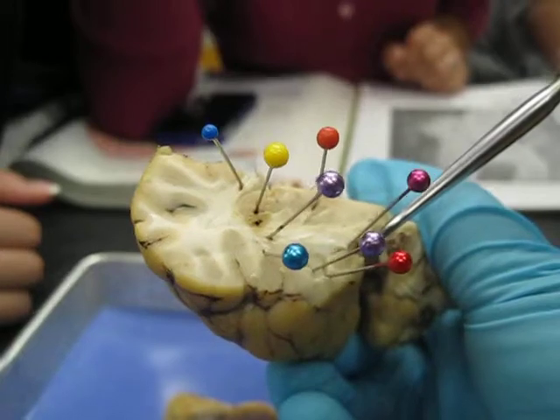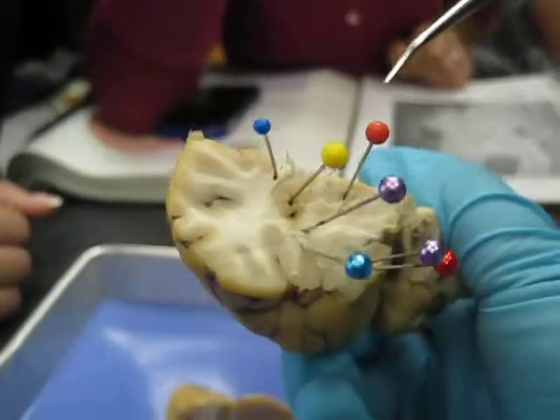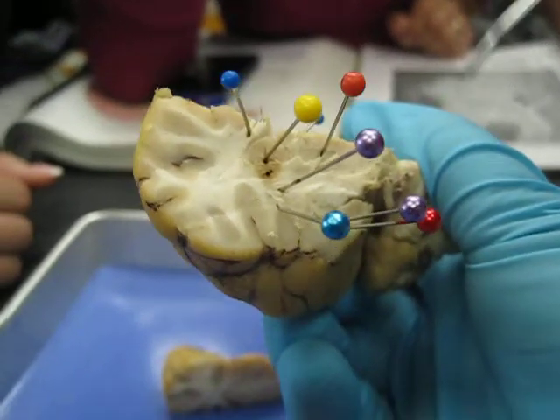What's this pink one? Did you guys pin this or did you? Giselle did. Well, you could take this. It fell off. You could take that off. Yeah. So that's pretty much it.